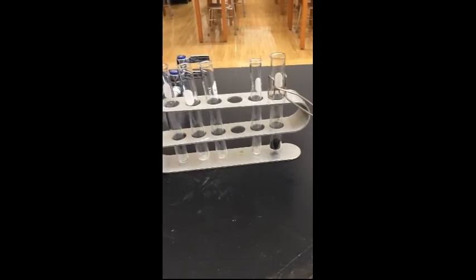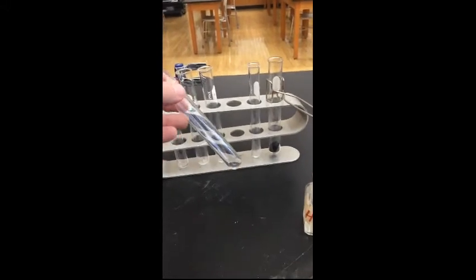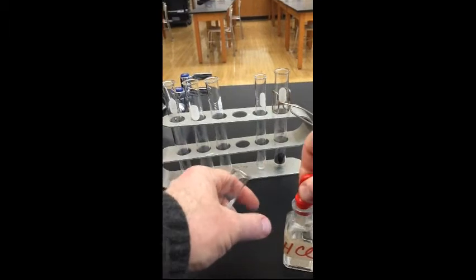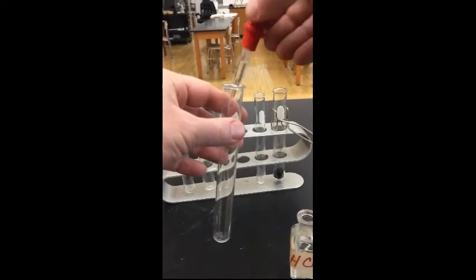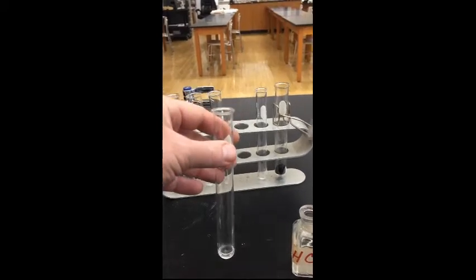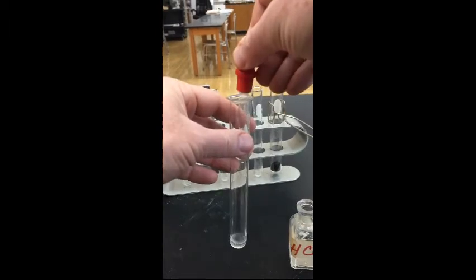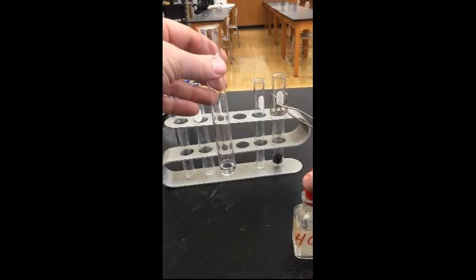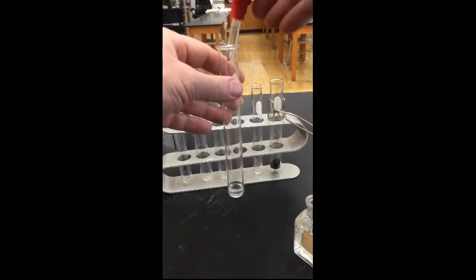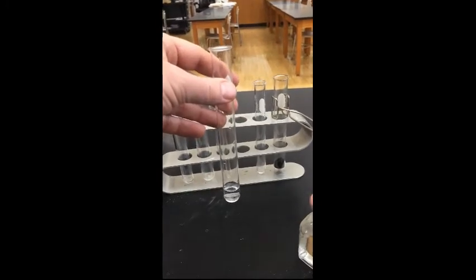Okay, for the next part of this lab, I'm going to take a test tube here. I'm going to put hydrochloric acid in it. I'm going to end up putting about 3 dropperfuls. There's 1, 2, 3 dropperfuls of the hydrochloric acid.